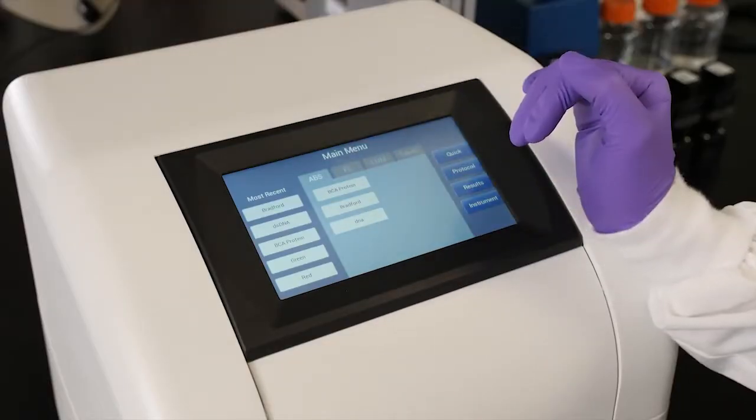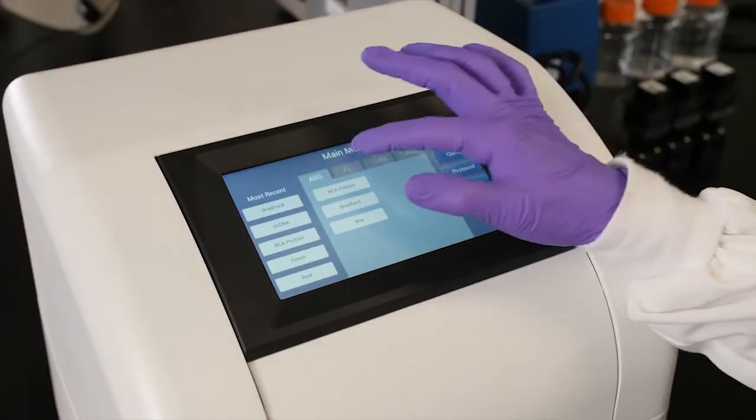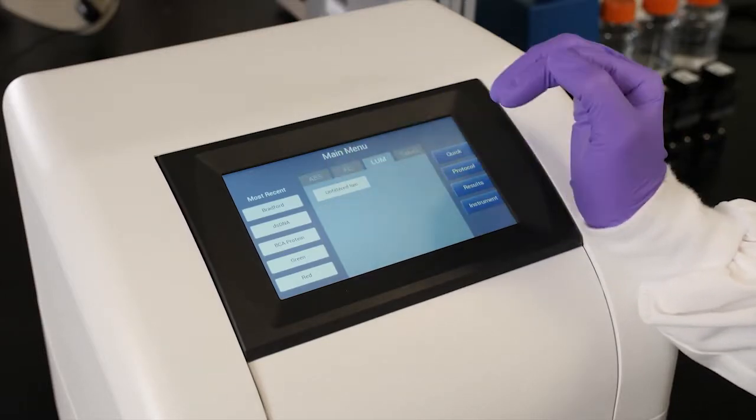Synergy LX offers monochromator-based UV-Vis absorbance, filter-based fluorescence, and luminescence at about half the price of similar multimode readers.